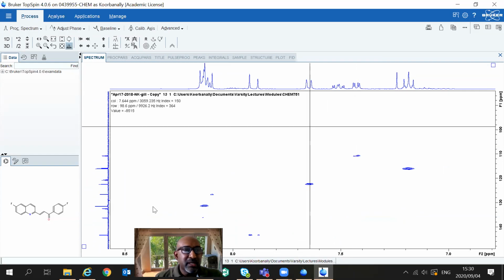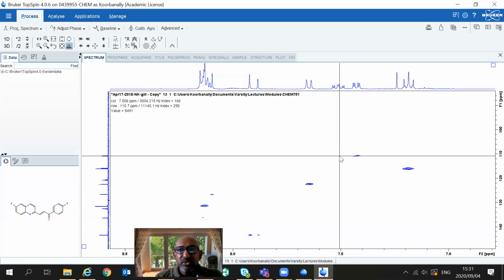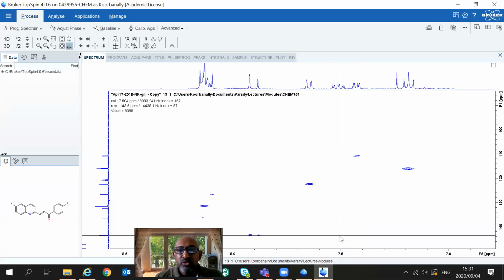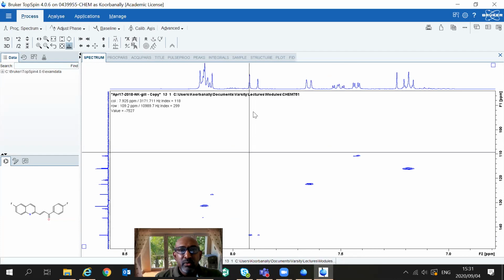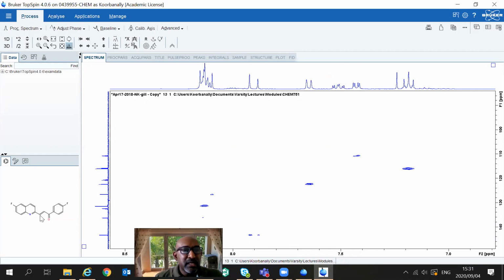You can see the proton at around 110, the carbon that I have here, must be this double doublet, which we identified as being here. So we identified this carbon as being here, which means that 1, 2, 3 bonds away, there must be a proton resonance somewhere in that vicinity. We also see that it's coupled to something that we said is at 142, and for 142 we can see your other resonance that we're seeing here.